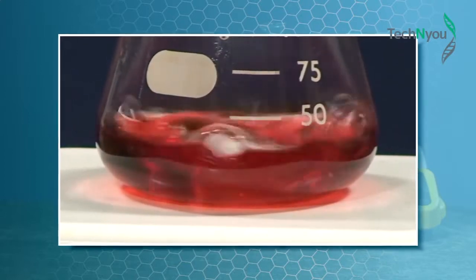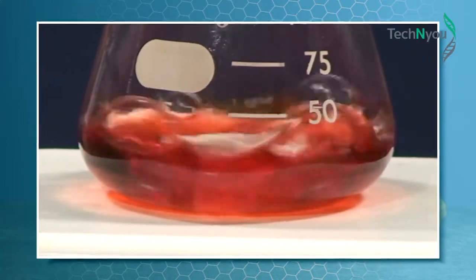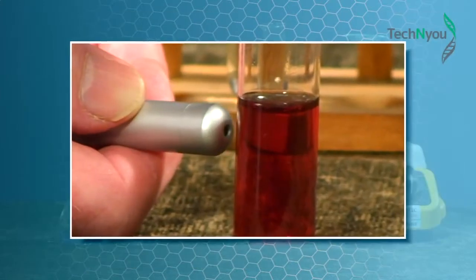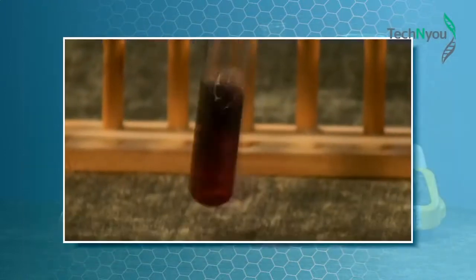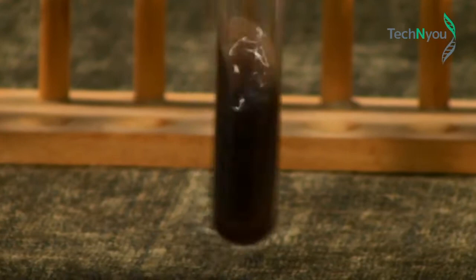This experiment aims first to make gold nanoparticles in solution. We call this colloidal gold. Then to demonstrate how a laser beam is used to test for their presence. And finally, to demonstrate how increasing the size of the nanoparticle changes its colour.